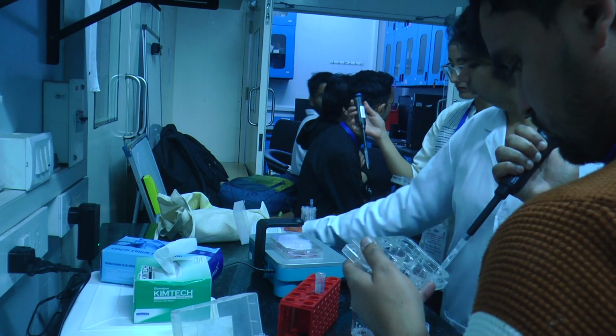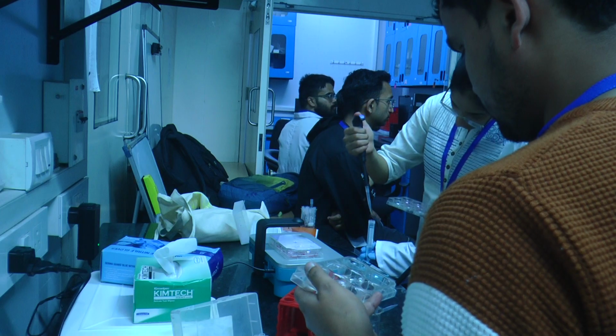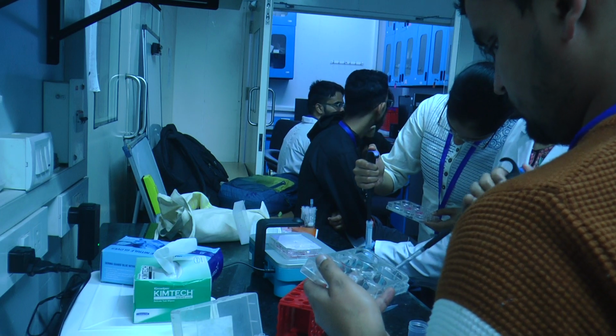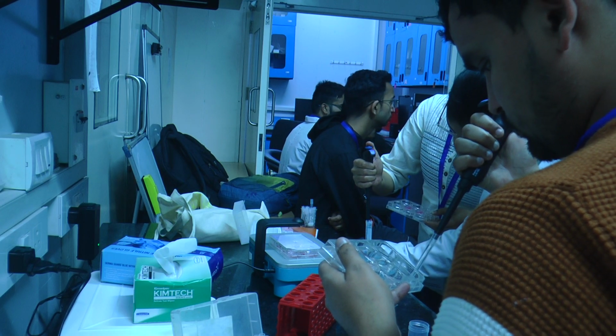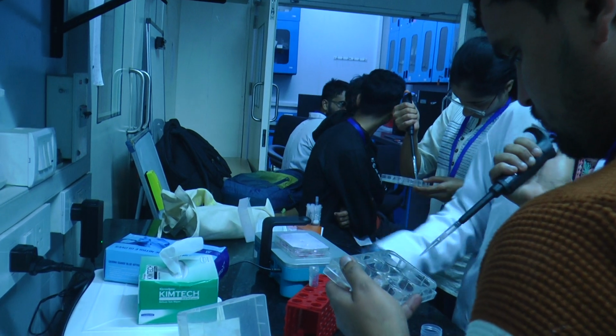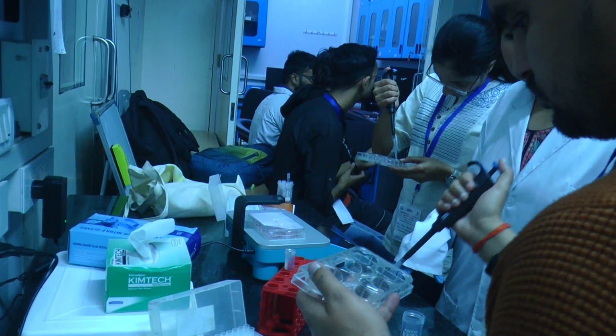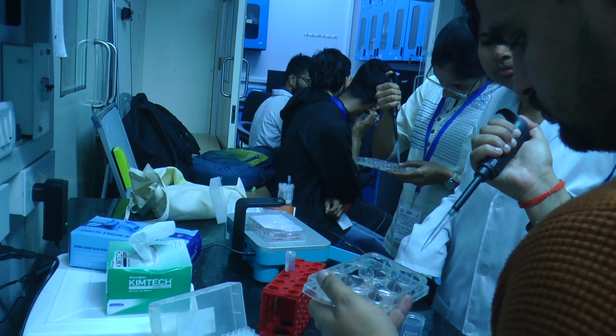Is it possible to keep the rest of the things for other purposes? No. In this system, because of what we are using, the cells will be dead after that. This is one-time use only. That is why I could only give you small amounts.